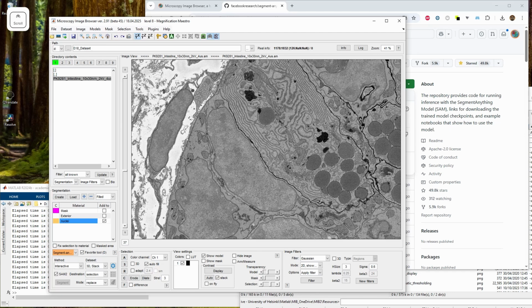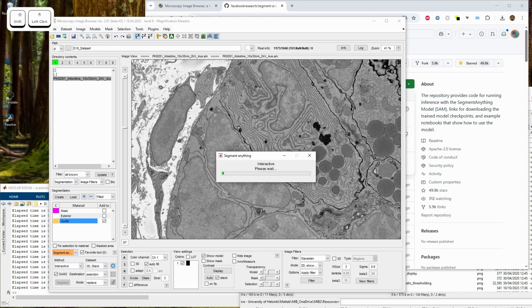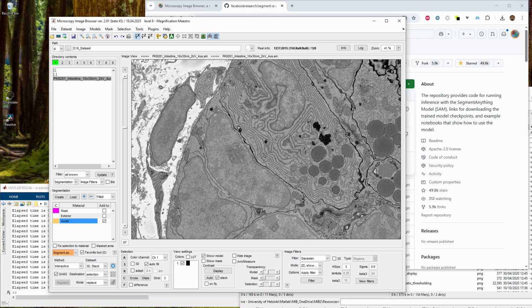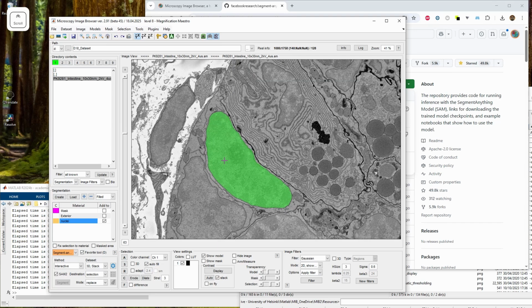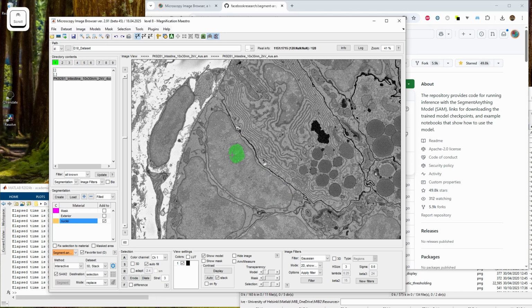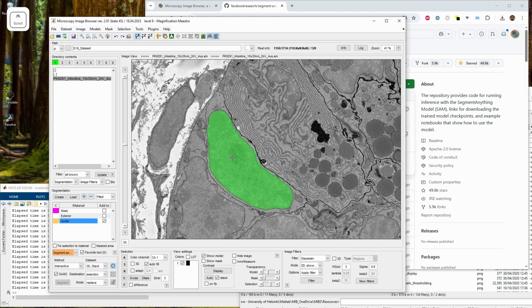There could be a little bit of lag at the end of this series. For example, let's say I start from here and scroll a little bit further. It processes them one by one, but when it reaches the end, this progress bar disappears. Then there is a bit of lag for a few seconds where it doesn't really react. So this is a bit of an annoyance. You can also see that when it was interpolating, the seed ended up in this region. It wasn't super nice.